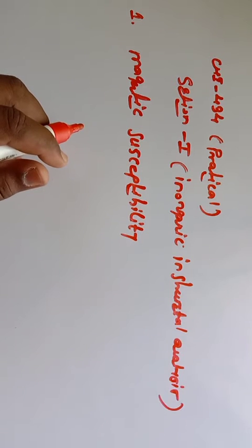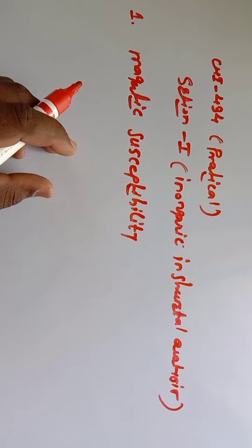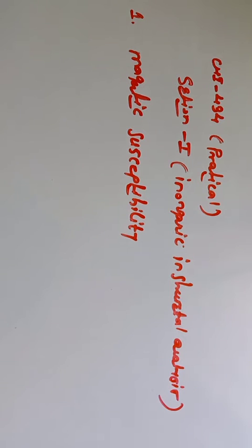We are very much familiar with this magnetic susceptibility, because in the previous semester there is one course in which this point is covered, that is susceptibility. So you already studied the theoretical concept regarding the magnetic susceptibility of the material. In this lecture, we are interested in the determination of magnetic susceptibility by different methods.